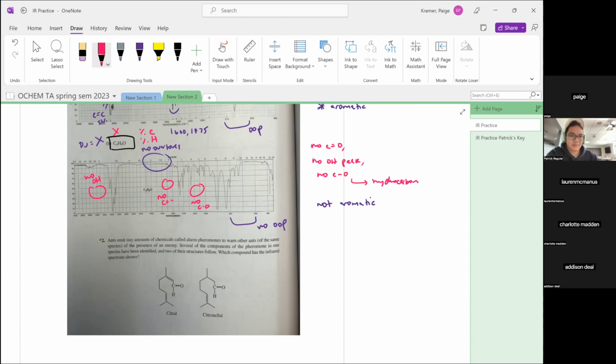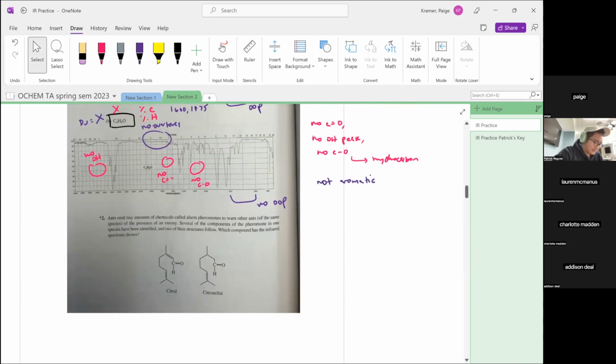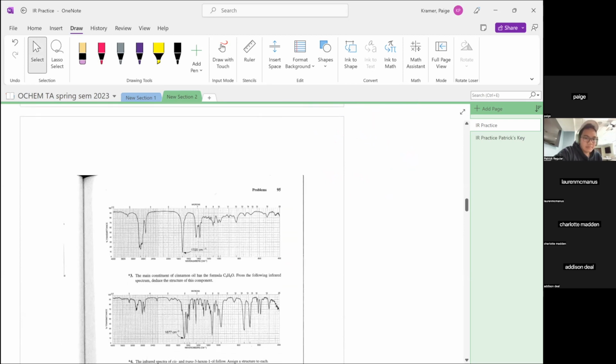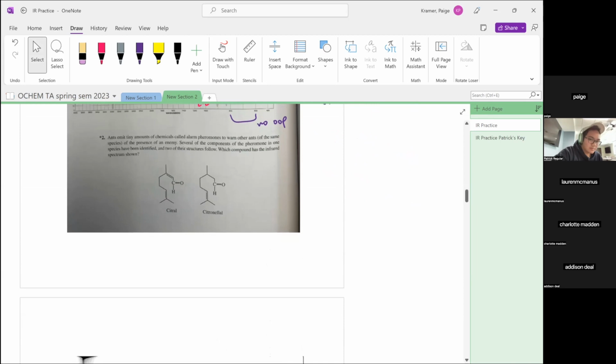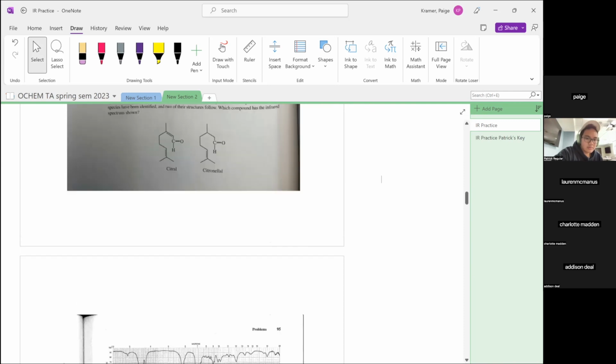Yeah, we don't like that. Okay. Down for this next one. Okay. This is going to come back to us later, so I'll look at this. It got split up, but this is attached.